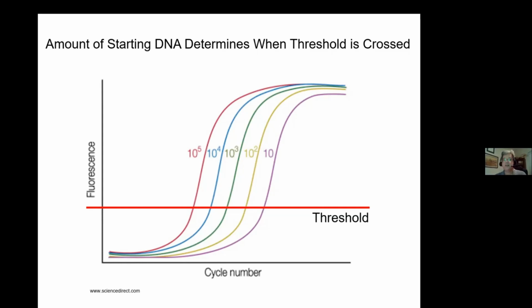All right. And I bring this up because this has been in the news lately, or in some of the science stories about using PCR to detect SARS-CoV-2 and talking about CT scores.